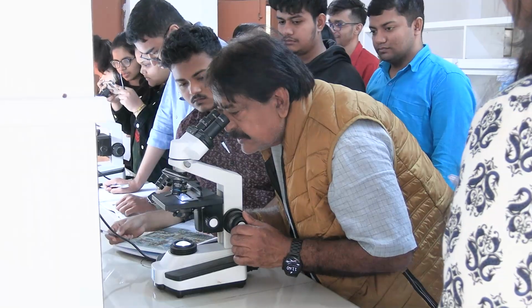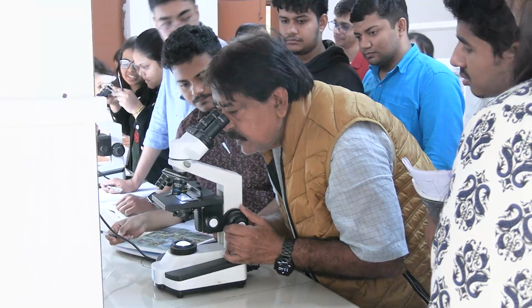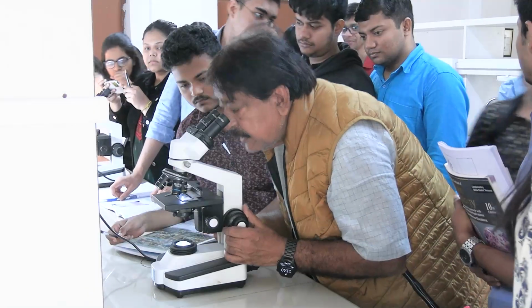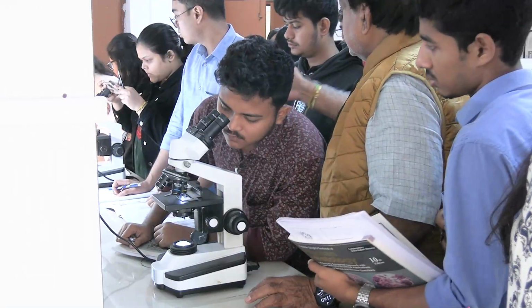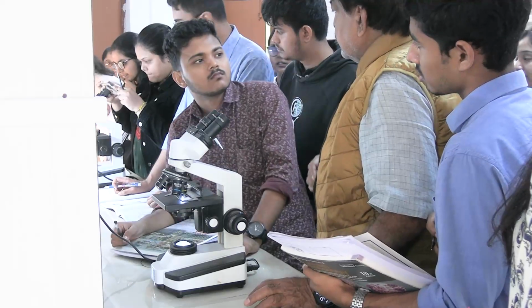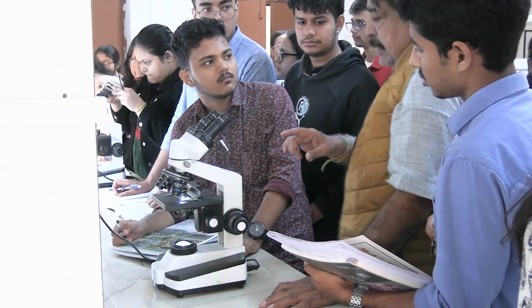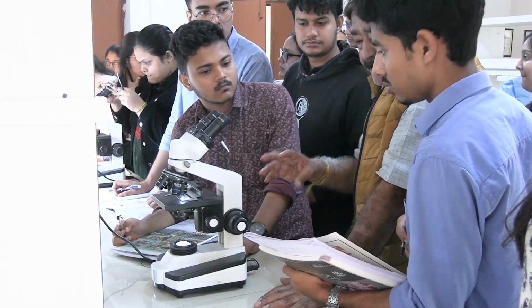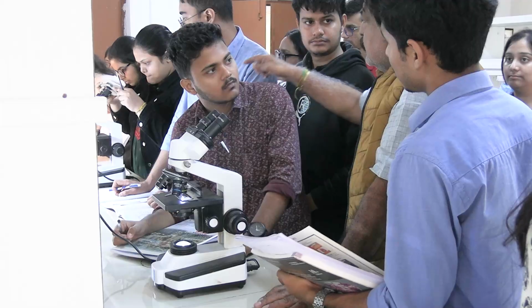But what I would rather say, one thing: you view this, and when you leave, you see those two slides. This one is a little lightly stained. So you see it, you don't waste your time. You see it, draw, and you go and see that.